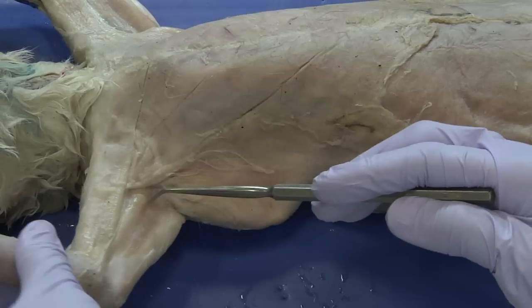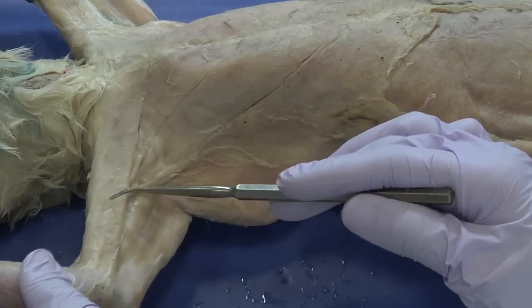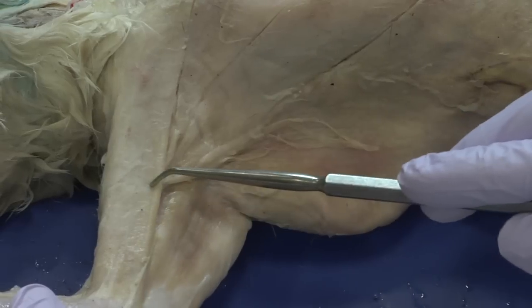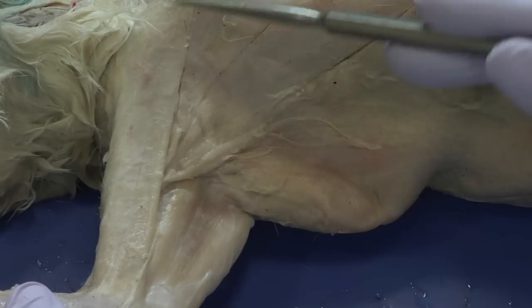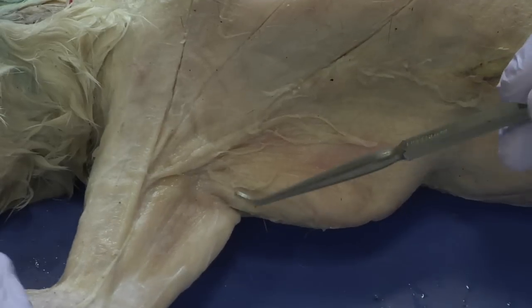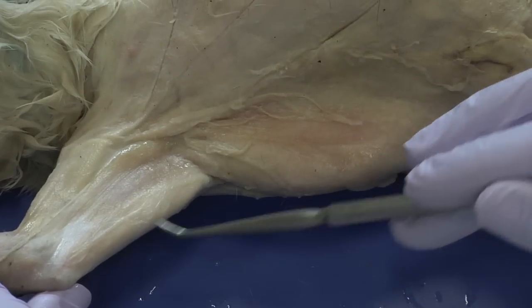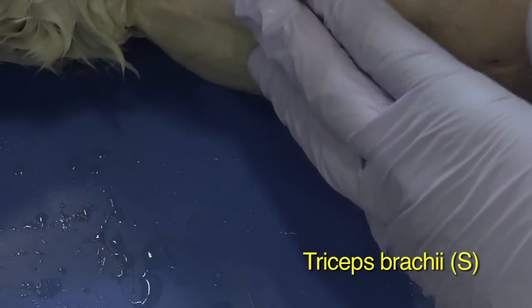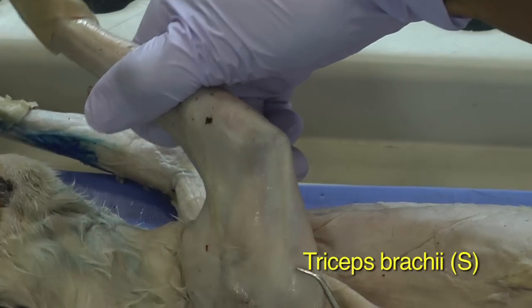The biceps, however, are underneath this muscle here. So this is going to require cutting across the midline of this muscle and reflecting it back. Just for emphasis: the tricep is already revealed, and the other head groups of that tricep are visible here.